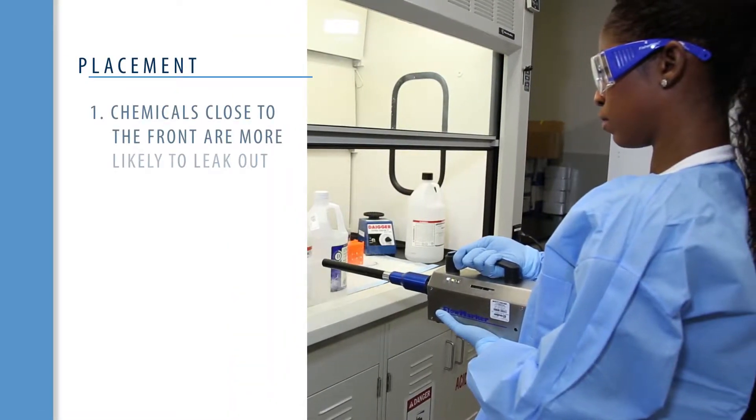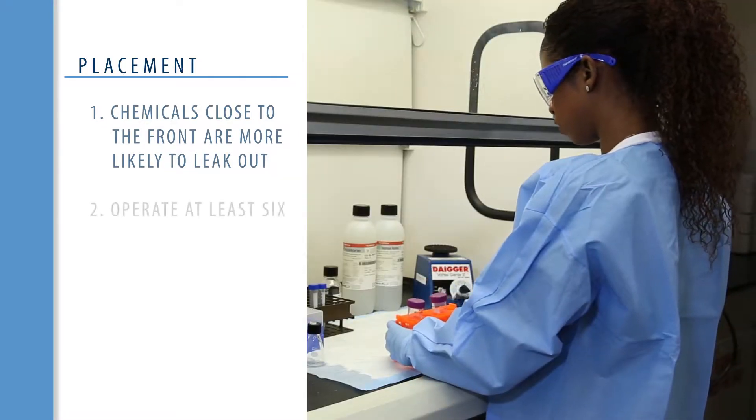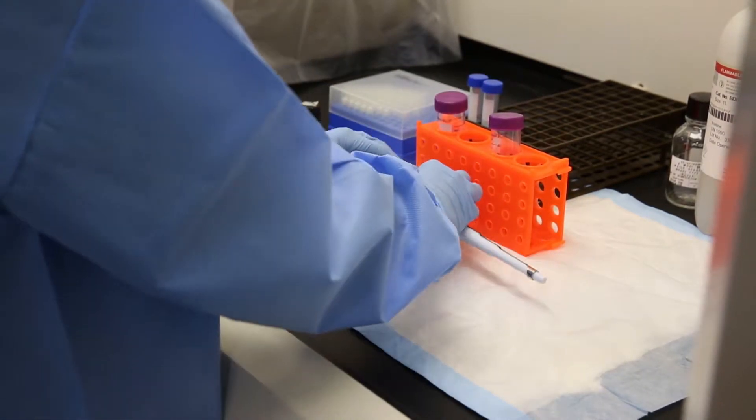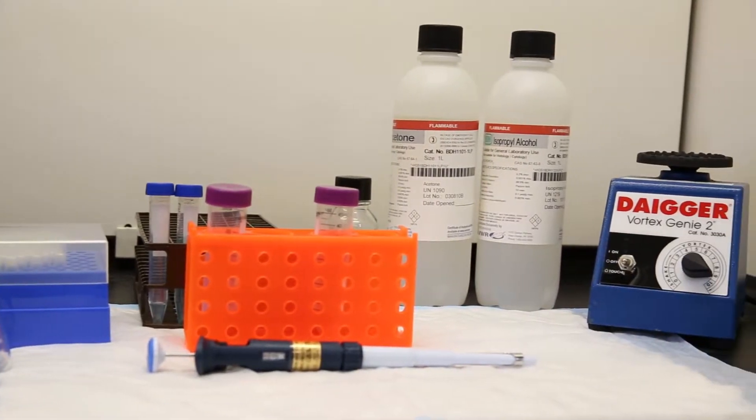Chemicals closer to the front of the hood are more likely to leak from the hood. Operate at least 6 inches from the front. The placement of objects close to the front opening may result in leakage and loss of containment.